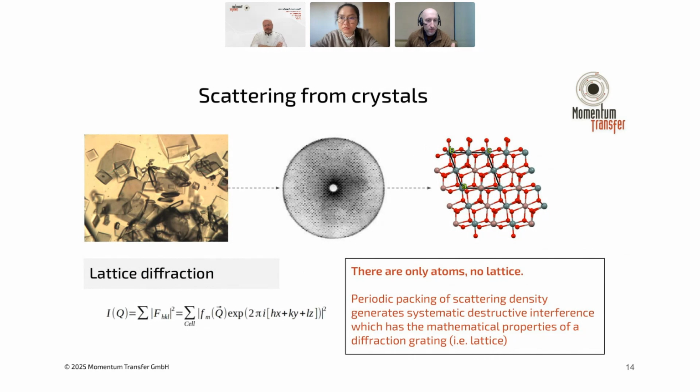This is just a mathematical concept that emerges from the behavior of the atoms. And so when we deviate from these assumptions being suitably correct, when we go to these nano systems, we don't really have such a good matchup with this assumption of infinite periodicity anymore. And so defining the system in that way becomes incorrect to the point that it makes it very difficult for us to be quantitative about what we're doing or to extract the information that we're looking for. So we need to go back to thinking about atoms and not necessarily mathematical lattices.